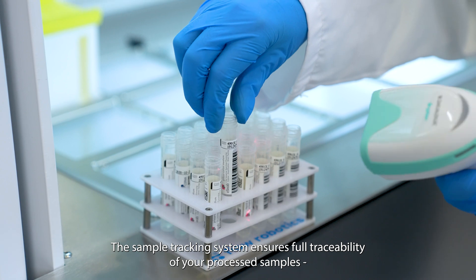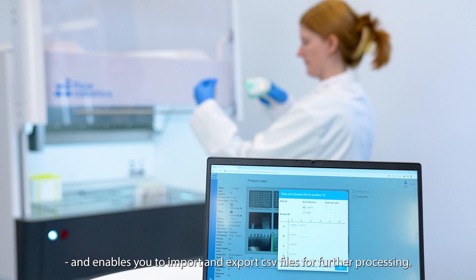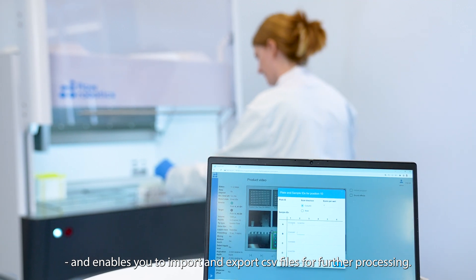The sample tracking system ensures full traceability of your processed samples and enables you to import and export CSV files for further processing.